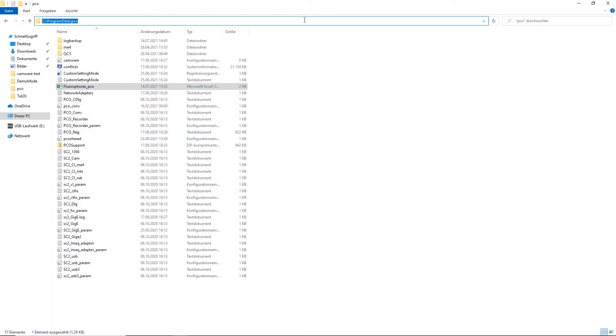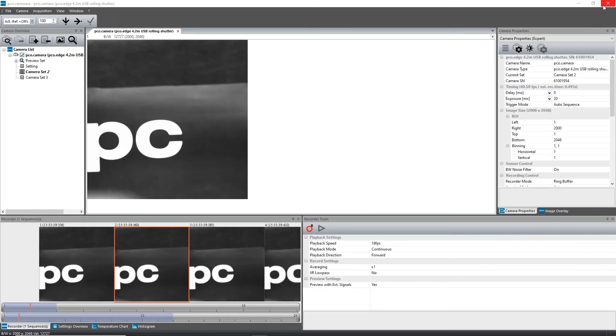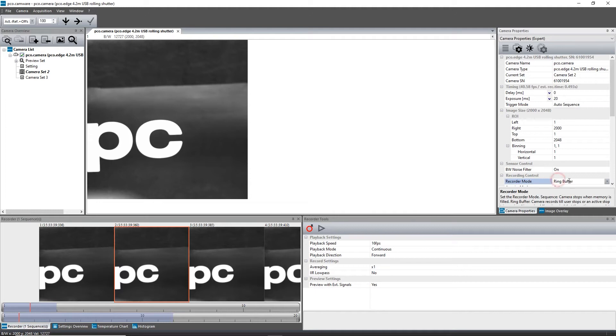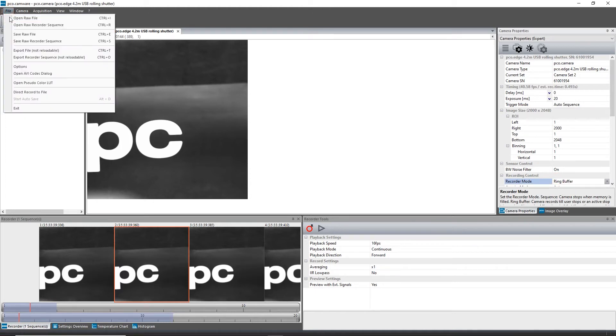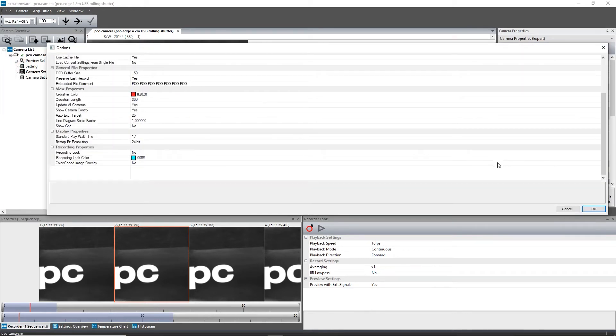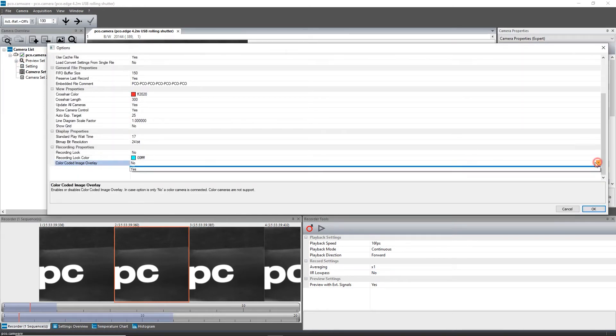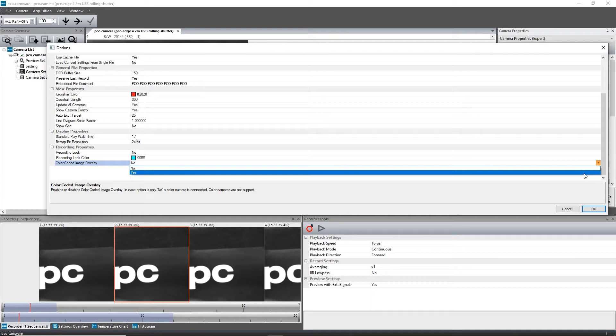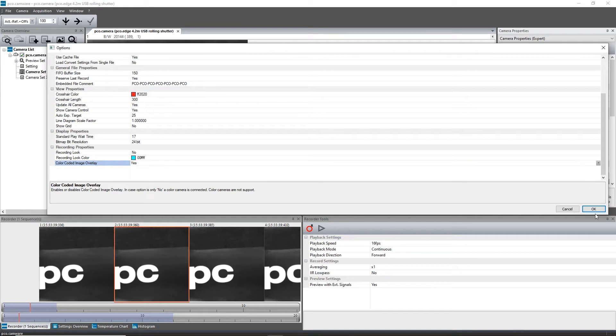Once the list is in the proper location, you can use it within CAMWARE. Set the recorder mode to ring buffer and then activate the color-coded image overlay via file options. Now it is possible to activate the color-coded image overlay in the recorder section.